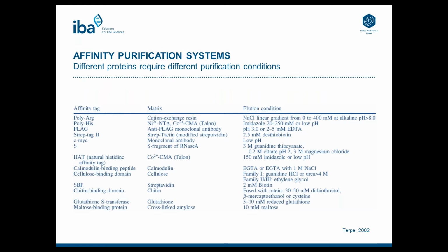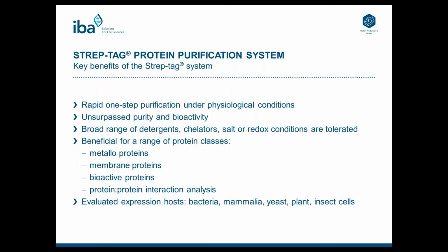Another example is the study of enzymes. Here it is important to preserve the bioactivity of these proteins. For this, physiological buffer conditions are recommended, such as used for the Strep-tag purification. The same is true for protein-protein interaction studies. Those interactions are destroyed when high ion concentrations or low pH are used.